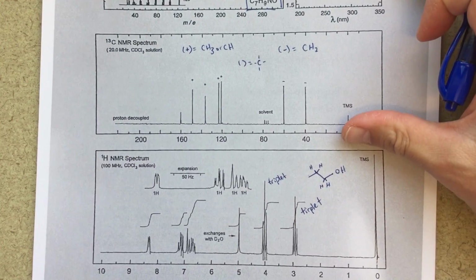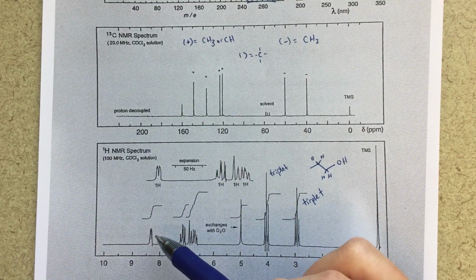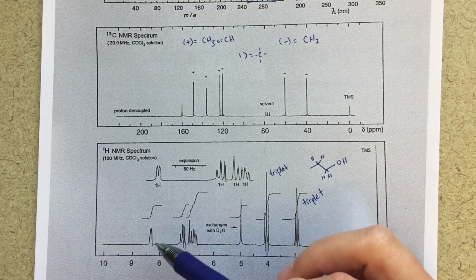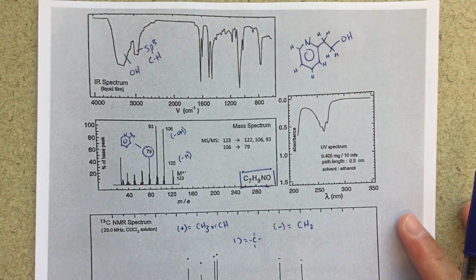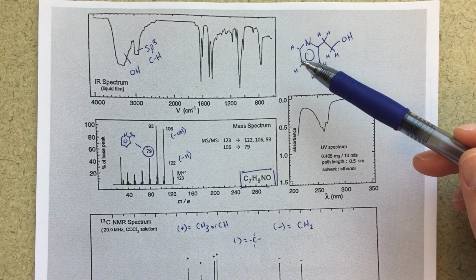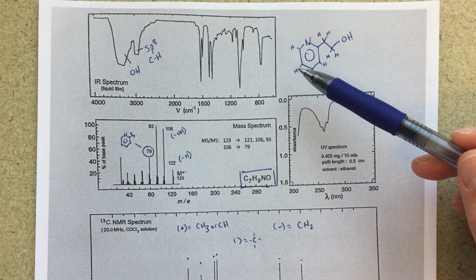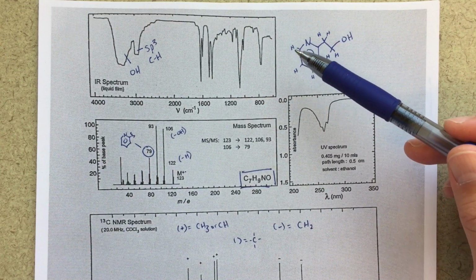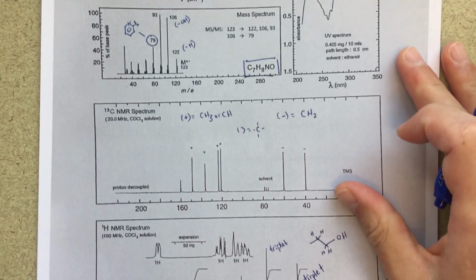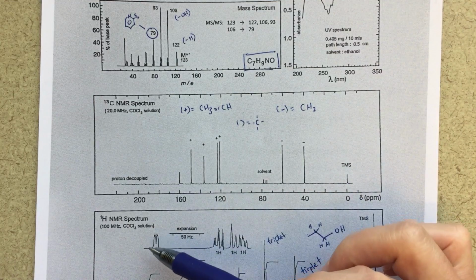Looking at our NMR, again, I've got 4 distinct aromatic protons. I would say that this peak that's set off from the other peaks would be this peak here. It should be split into a pretty clear doublet from the splitting from this hydrogen here. So we're talking about this proton here. That's going to be split into a doublet, and that proton would be further downfield because of its proximity to the nitrogen. So again, that would be this proton here.